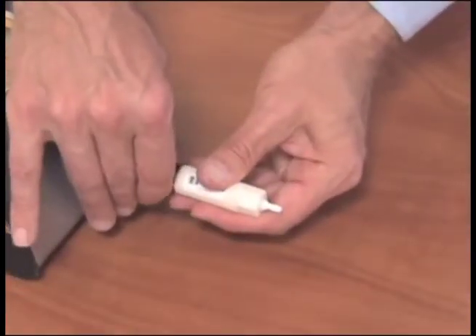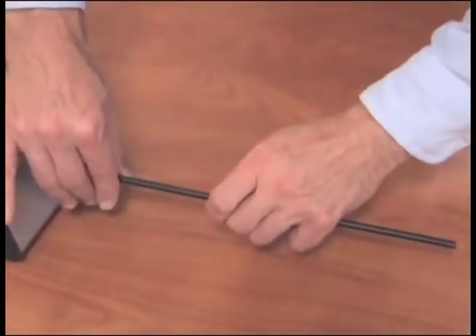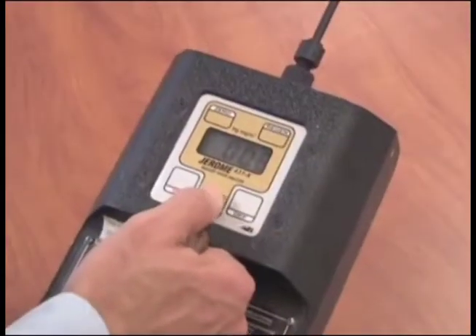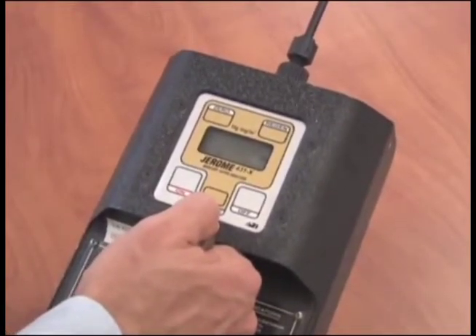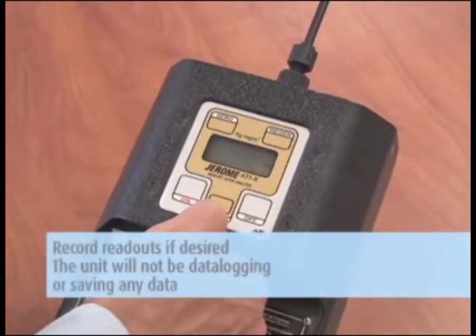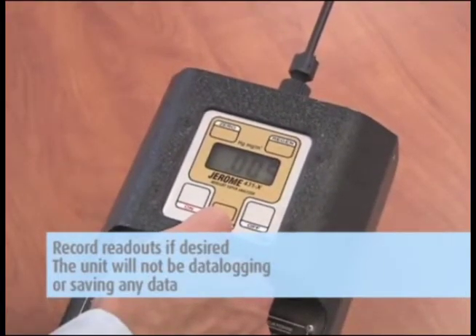Remove the zero filter when complete. To start your survey, connect the probe and turn the unit on. To collect a sample, point the probe where you want to draw your sample and push the sample button. Go on to the next location and repeat. Continue until done. Record readouts if desired, as the unit will not be data logging or saving any data.